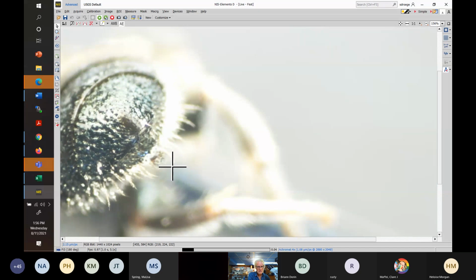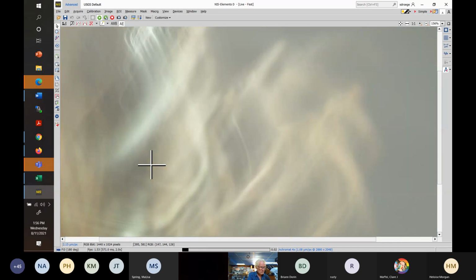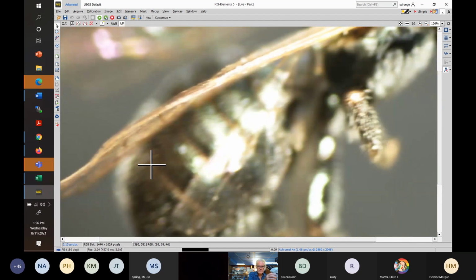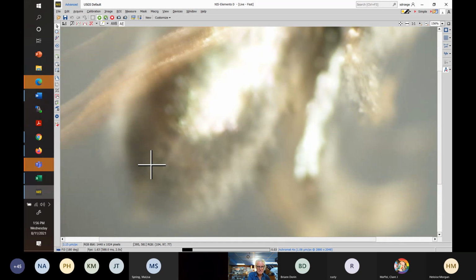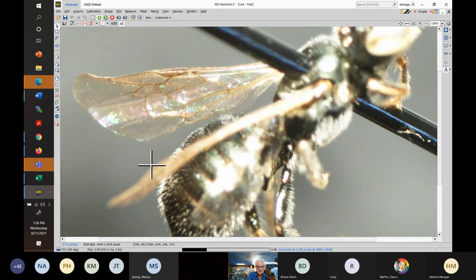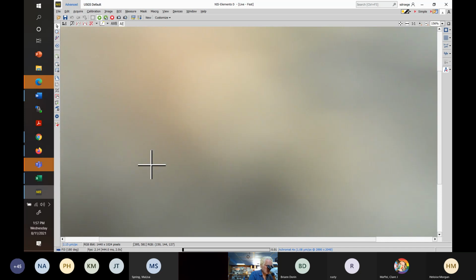You can see, I think, in the various iterations of the lighting there, that it's just quite a small segment. So that's good. And then when you look at the hind femur on this one, it's going to look exactly like the triangle shape of Calcarata. Calcarata, though, has a very wide flange on its rear leg, and I've got to locate it here.